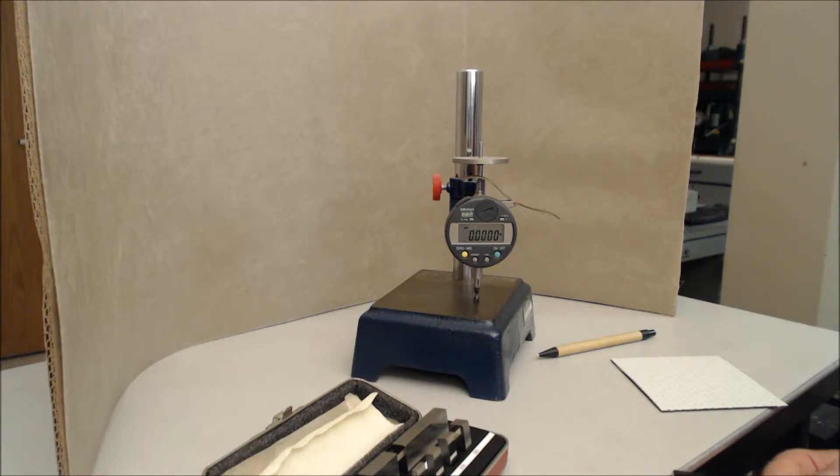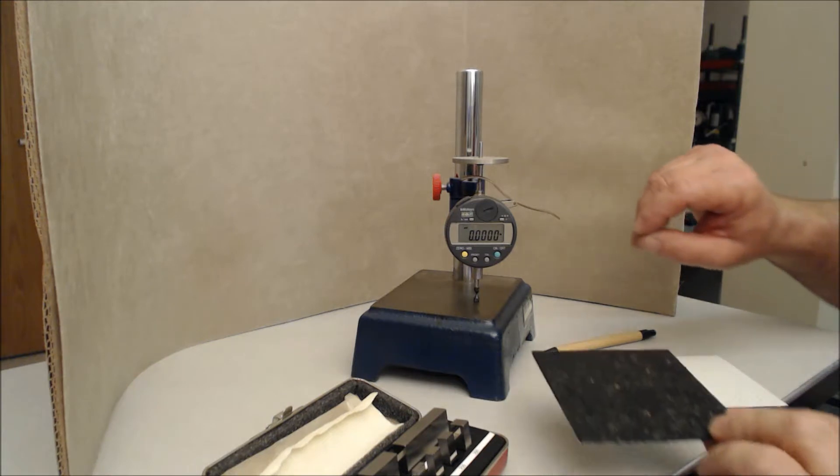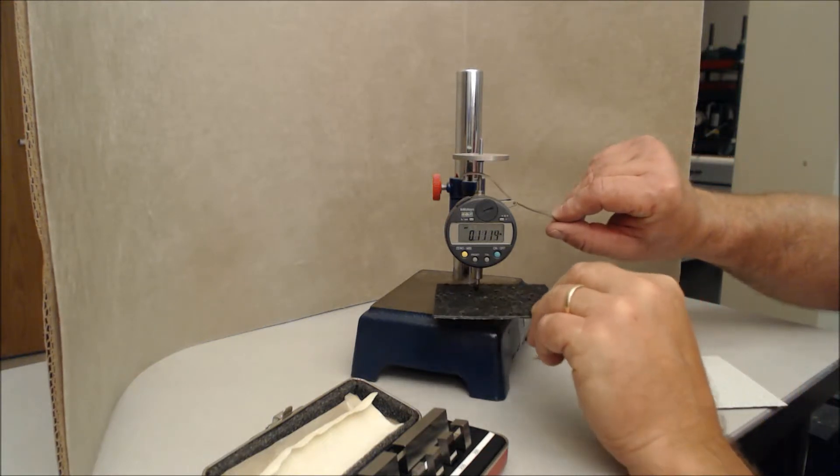What you have to do for this is take three readings, and then you'll take the lowest of the three readings. So you search out the valleys.